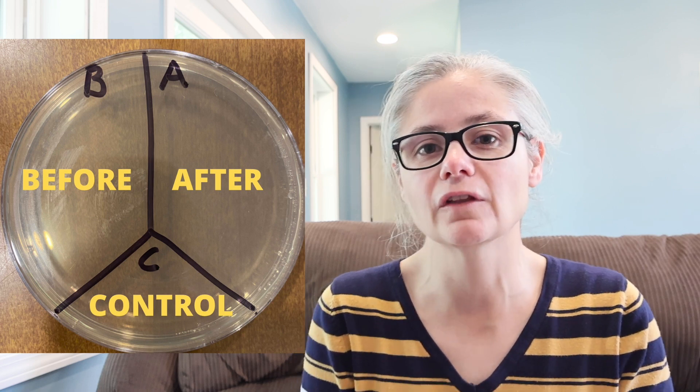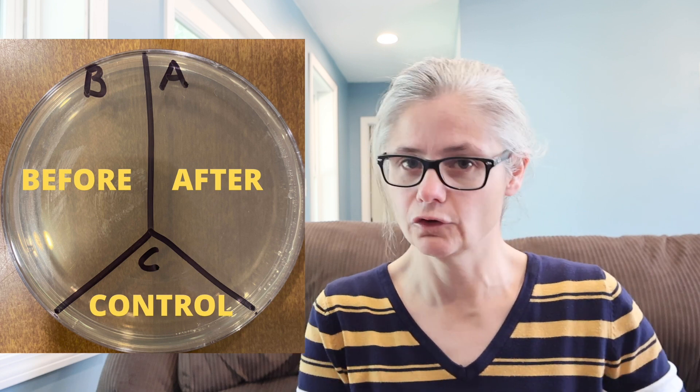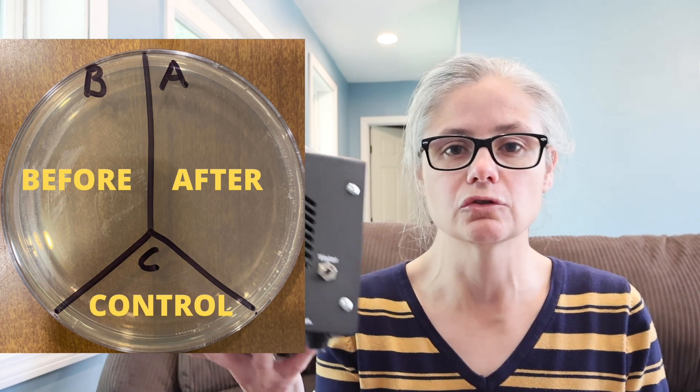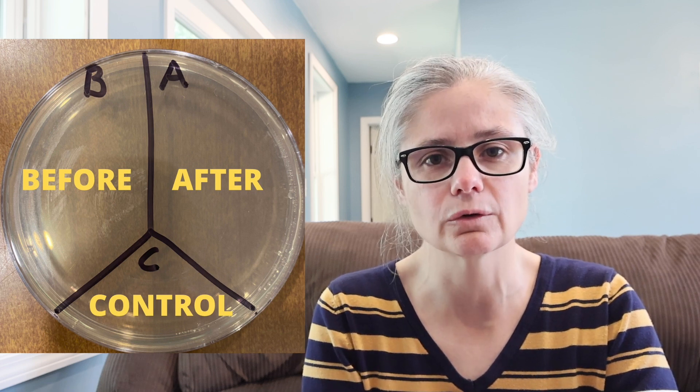In order to test how well this water ozone generator removes bacteria from lettuce, I'm going to take a Petri dish and label sections A, B, and C. I'll take sterile swabs and swab the lettuce, placing that sample in section B for 'before.' Then I'll wash the lettuce using this ozone generator, remove it, rinse it, dry it, swab it again, and place that sample in section A for 'after.' C is the control — nothing goes there.